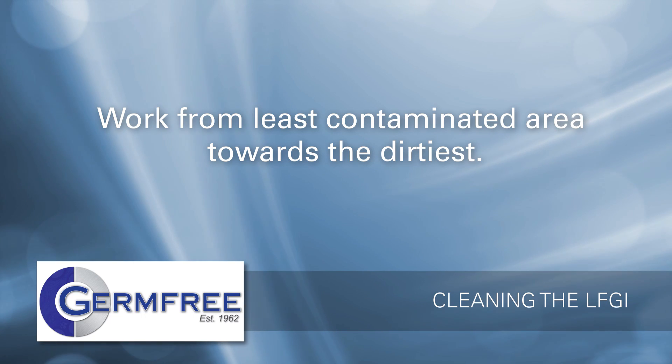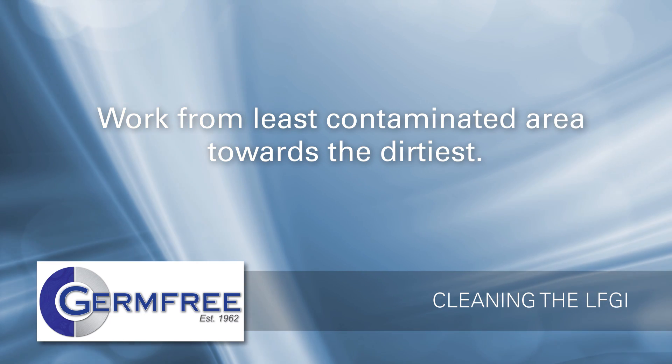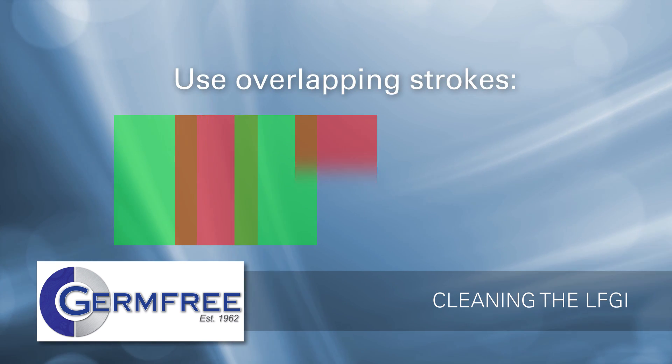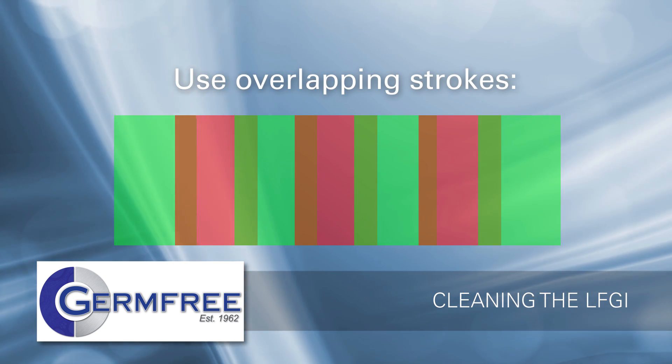To get the best results, start cleaning in the area with the least contamination and work your way toward the dirtiest. Use overlapping strokes to ensure that you don't miss anything.